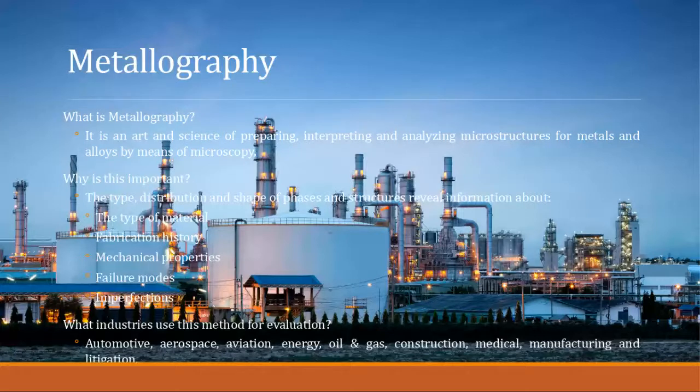Imperfections can be anything from inclusions, lack of fusion if you're talking welds, just maybe the wrong grain size for the wrong application. And what industries use this method for evaluation? Well, if you think about it, when it comes to engineering, there would be no such thing as engineering without metallurgy, right? So metallography being a technique through metallurgy, you're looking at automotive, aerospace, aviation, the oil and gas, energy sectors, construction, medical, manufacturing, and litigation.